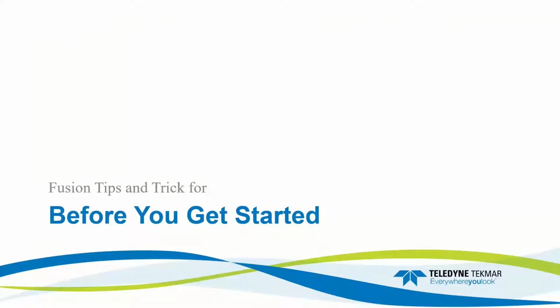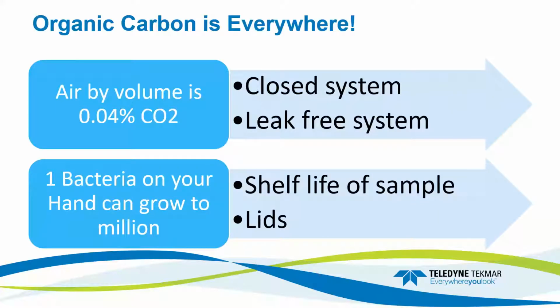So let's talk about some tips and tricks before we get started. This might fit in for some drinking water analysis, but it's typically for low-level analysis, when we're talking about less than 1 ppm. Organic carbon is everywhere.